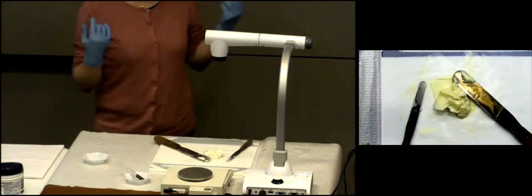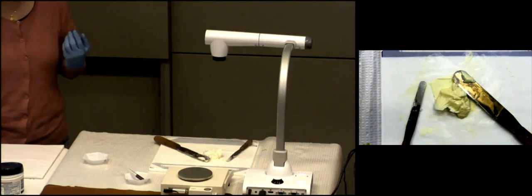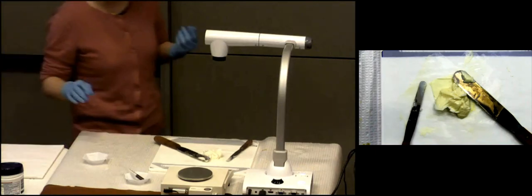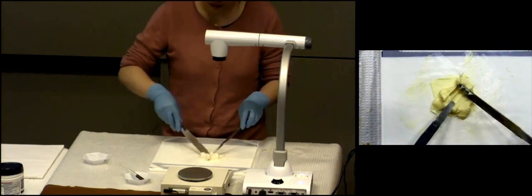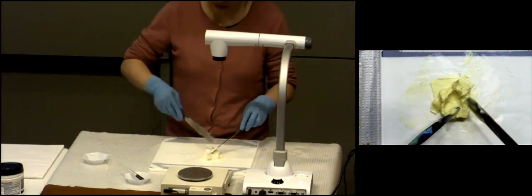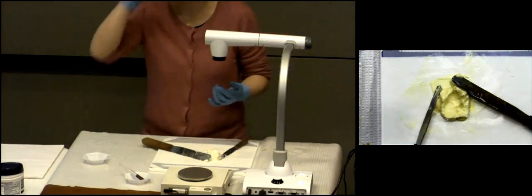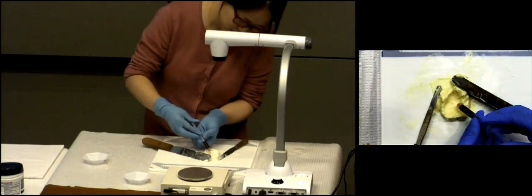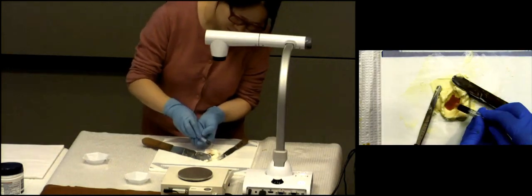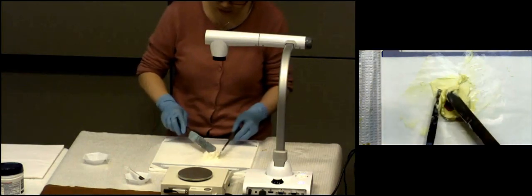All right. Are we ready to transfer? Can we go ahead and transfer now? Not quite yet. What did I forget? Step 5. Look at step 5. And I guess my question is, did we add all the LCD when we levigated? Why couldn't we have just added the rest of that LCD right when we were levigating? What would have been the problem with that? It would have run everywhere. Would you agree? There wouldn't have been any liquid or anything solid to hold on to that. So that's why now we're going to add the remainder of it.